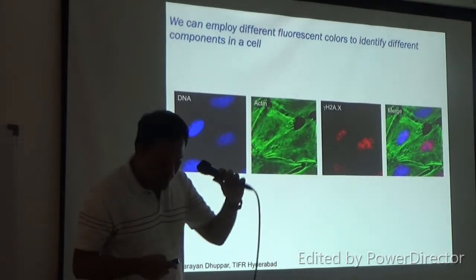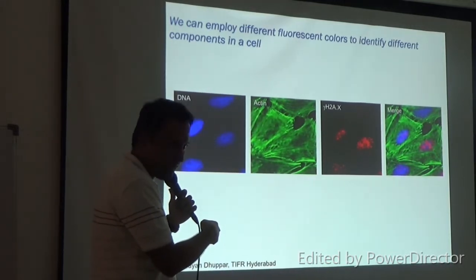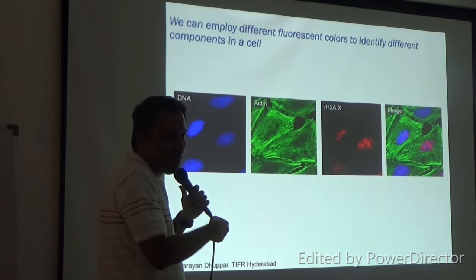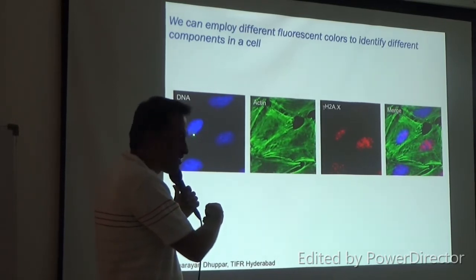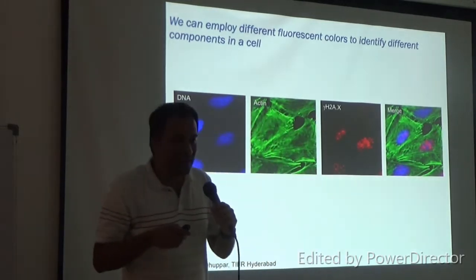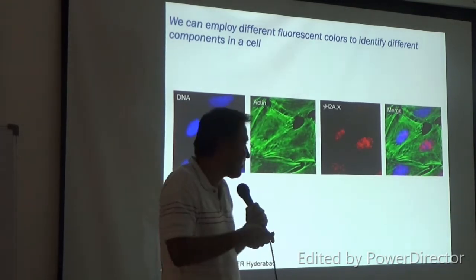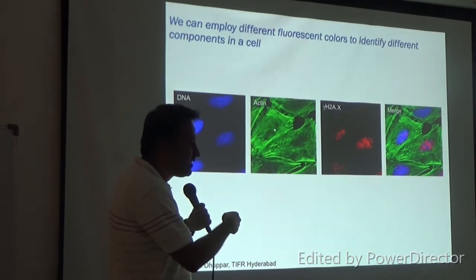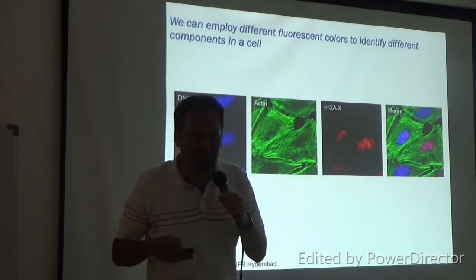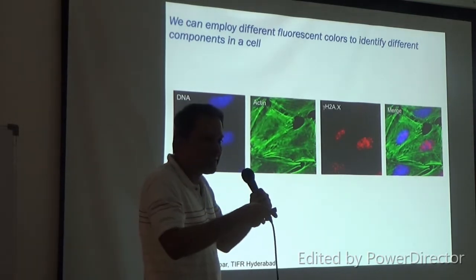And with that, you can do, like here, the DNA in a cell is marked with DAPI, which is a DNA binding dye, excited at about 360 nanometers and emitting at about 420 or so nanometers, so this is where you're seeing it blue. Here is the cytoskeletal structure called actin. When the neutrophil was moving, it was actin which was polymerizing and depolymerizing differentially at the two ends of the cell, right? And that is marked with phalloidin, marked with ATTO 488, which, as the name implies, is excited by 488 nanometers and emits at about 510 nanometers or so. So it's excited in blue, emits in green.